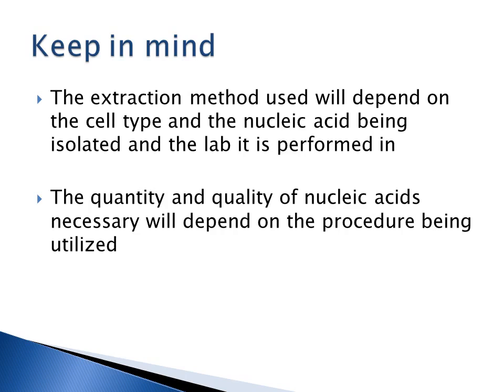So things to keep in mind. The extraction method that you're going to use is going to depend on the cell type and what type of nucleic acid, DNA or RNA, you're trying to isolate, as well as the laboratory you're using. Also, the quantity and the quality of your nucleic acids is going to depend on the procedure that you use.